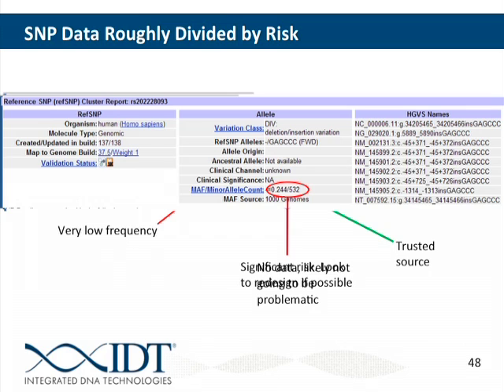And I did forget to mention, when you input your primers into BLAST, you can also put your probe in there as well. So you can put your forward primer, several Ns, your probe, several Ns, and your reverse primer, and BLAST them all together and check for SNPs for all of them at the same time.